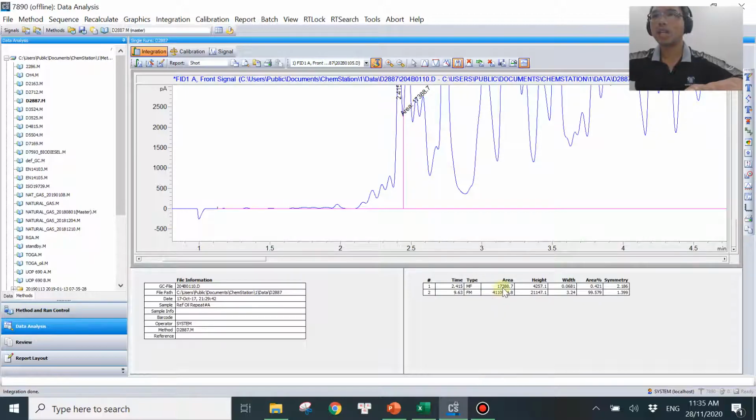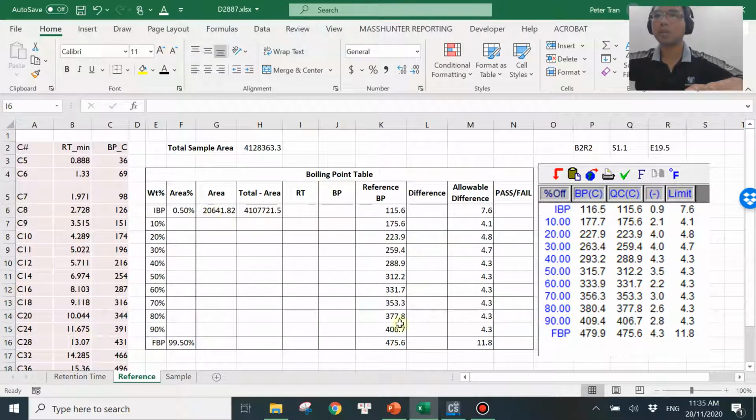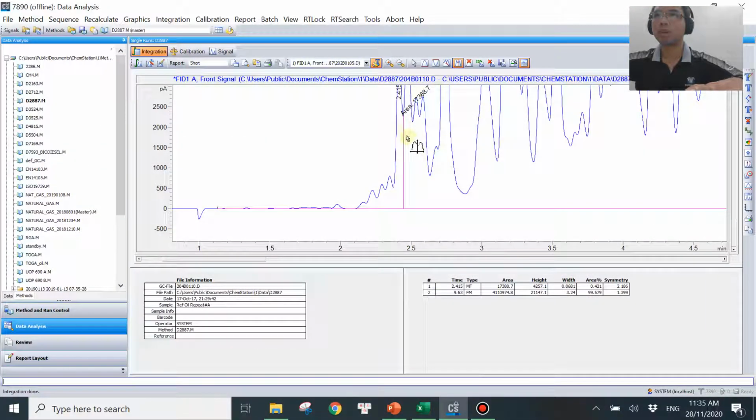Over here, I get 17,000, right? And now I need 20,000 something, but here is only 17,000. So that's a little bit too little. Here a little bit too much, here a little bit too little. So I will be somewhere in the middle. So remove one more time. I do this one more time.